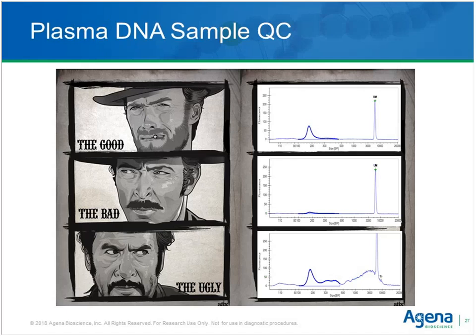Well, here you see a couple of examples of why quality controlling is a good idea. You can assume having a good sample, a not so good sample, or even something that you don't want to have. In the top panel, you see target fragments of the desired length. Actually, the second peak on the right-hand side is a length marker for the sizing, so don't worry about that one. The peak to the left is what we desire to see.